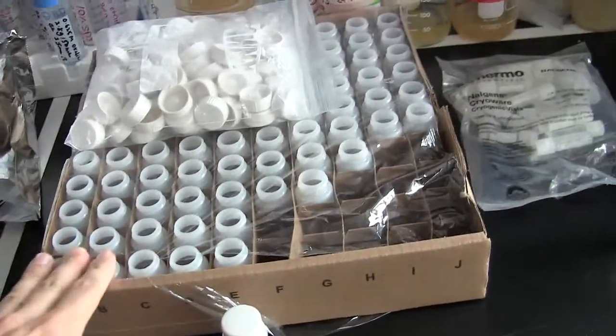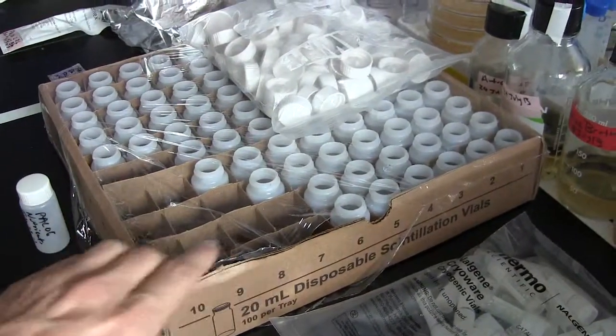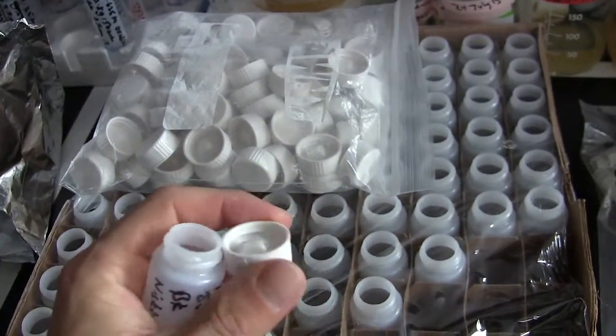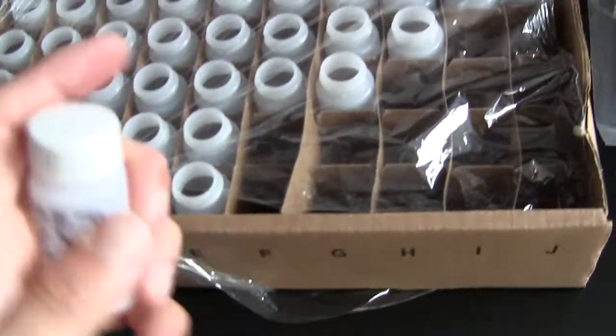They come in this large tray. They're actually scintillation vials, so 20 ml scintillation vials. Note the cap on these has a plastic insert. You can get them with a metal insert, but we try not to use those. I don't know if they contaminate the sample or not.